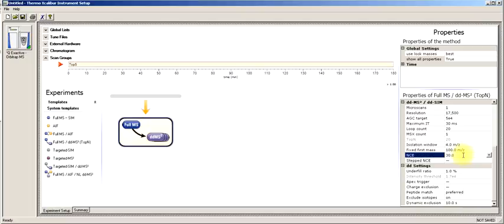NCE, this is our normalized collision energy. On the QE, it's worth noting that the HCD cell is really the newest and most advanced HCD collision cell that we have ever produced, and it's really efficient. On most instruments that I've worked with, I see really good fragmentation between 26 and 28. There's still a little bit of variability for individual machines and the exact pressure of the gas coming in, but in general, I like to start at 26, 27, 28. 30 is going to hit your ions just a little too hard in every example that I've seen.